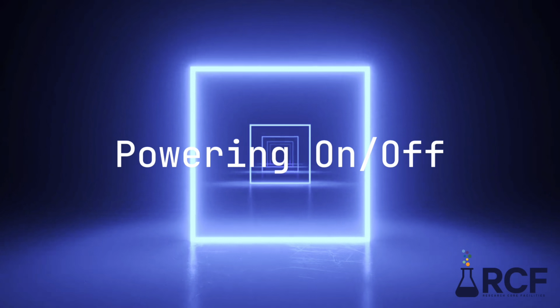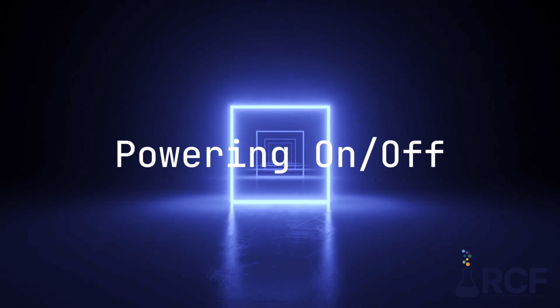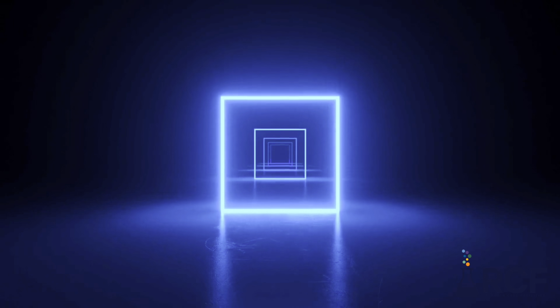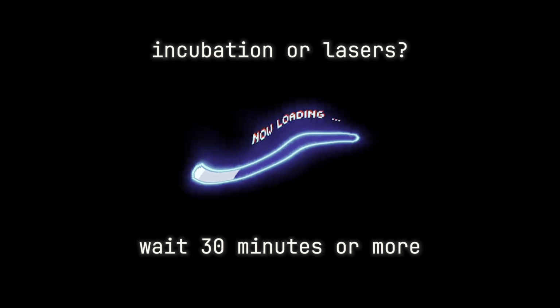In this module, we'll train you how to power on and power off equipment. For powering on equipment, if you're using a system with lasers, or if you require incubation, you must turn on the system at least 30 minutes prior to imaging. This allows enough time for the lasers to reach full power, and for the incubation systems to equilibrate. Some incubation systems might require more time.